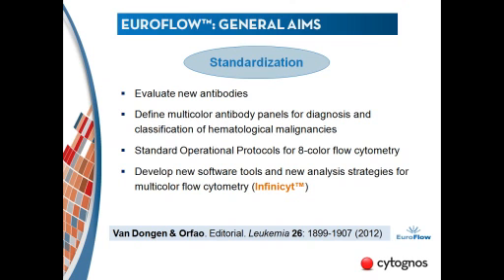In order to do this standardization, they needed to evaluate new antibodies, to define multicolor antibody panels, to define all the standard operating protocols, staining of the samples, calibration of the cytometer, all oriented to 8-color flow cytometry, and of course to develop new software tools and new analysis strategy for multicolor flow cytometry, which is the Infinicyt software.